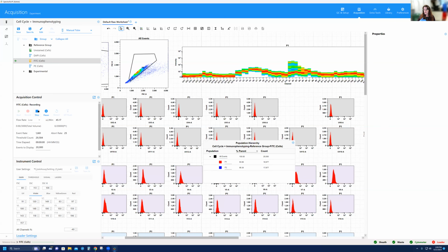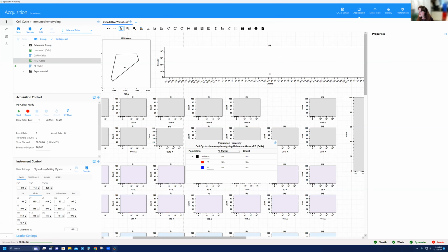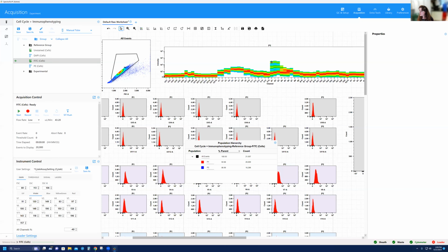We can have an understanding of what the spectral profile of a certain fluorochrome is by looking at spectra viewers online. So I know that FITC is excited off of the blue laser line, and it emits right around 520, if my memory serves me correct, and that's around B1, B2, right? So when I look at that, this is what I see. Now you also see this kind of population right here from B1 to B3. You see a moderate, and then you see a high.